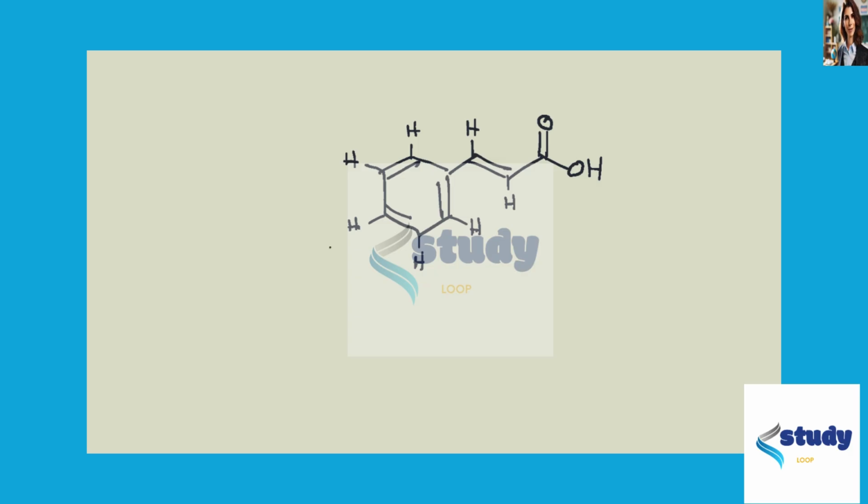Because we have some symmetry here, which means that these two protons will share a signal, and these two protons will share a signal, right? Because they are chemically equivalent, which is also represented by the fact that we could rotate freely about that bond, meaning that these hydrogens aren't spatially unique. They could easily take each other's places by rotating about that bond.